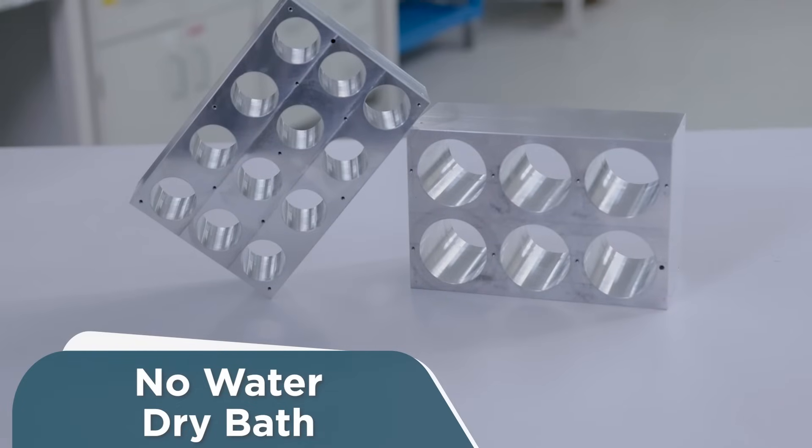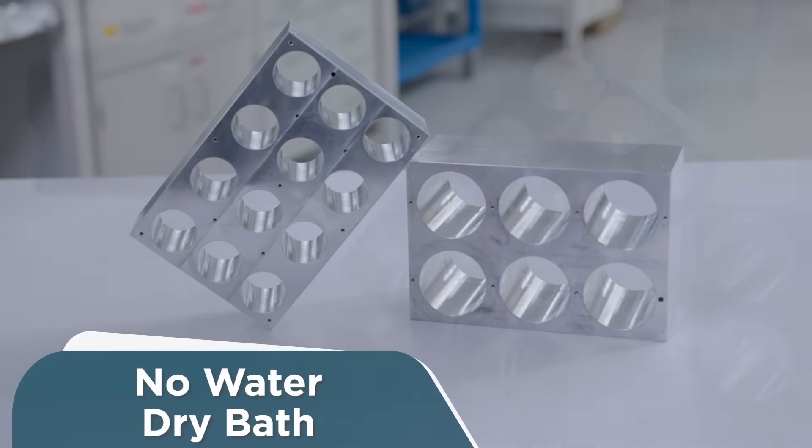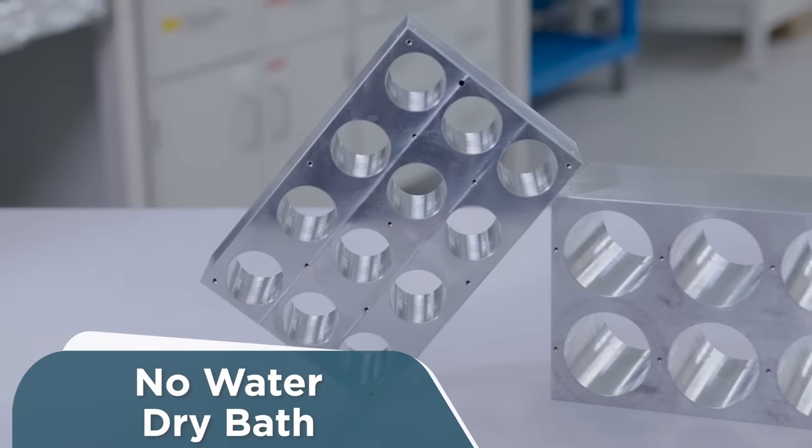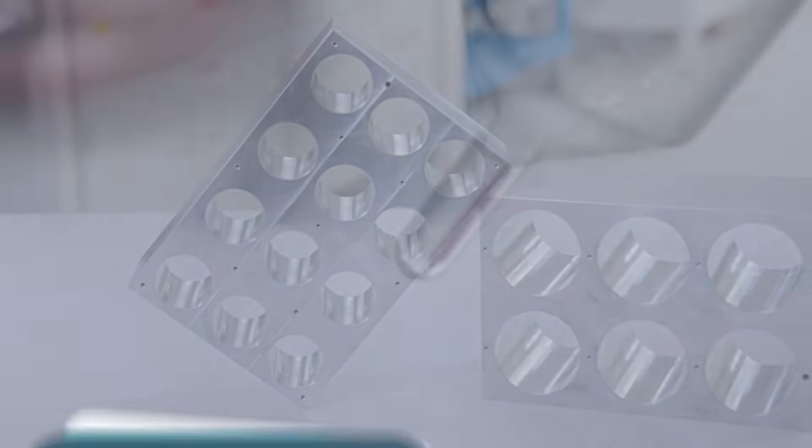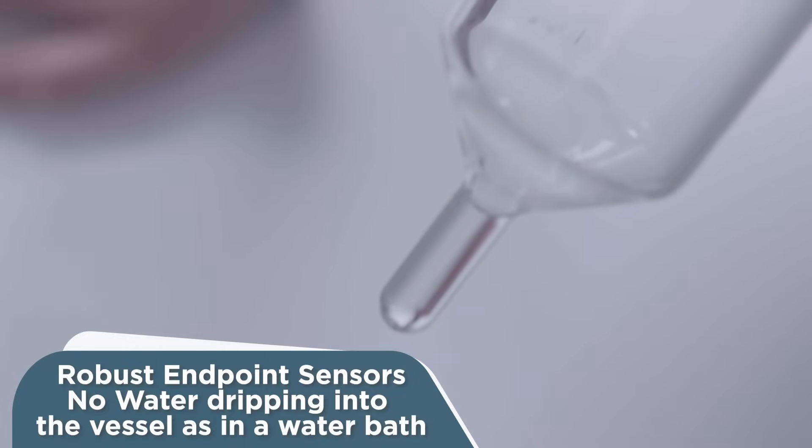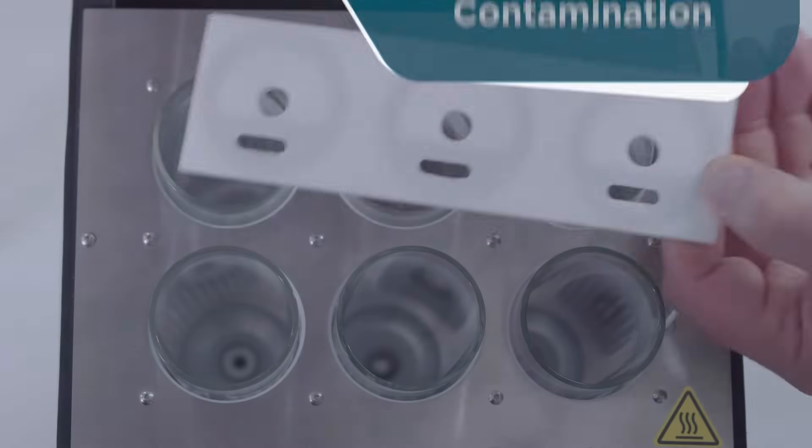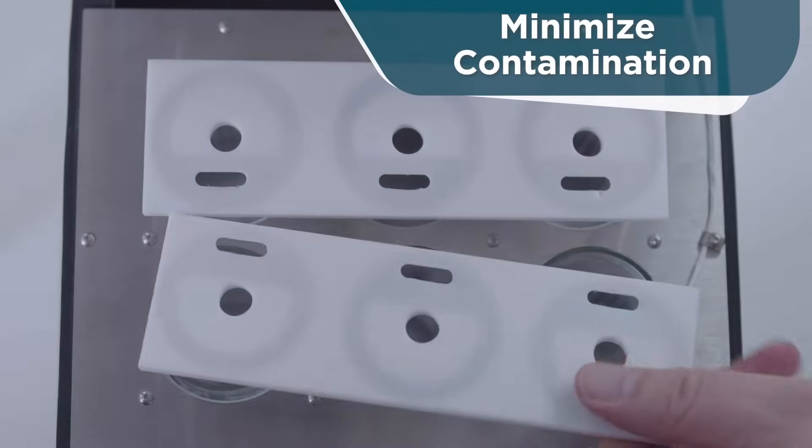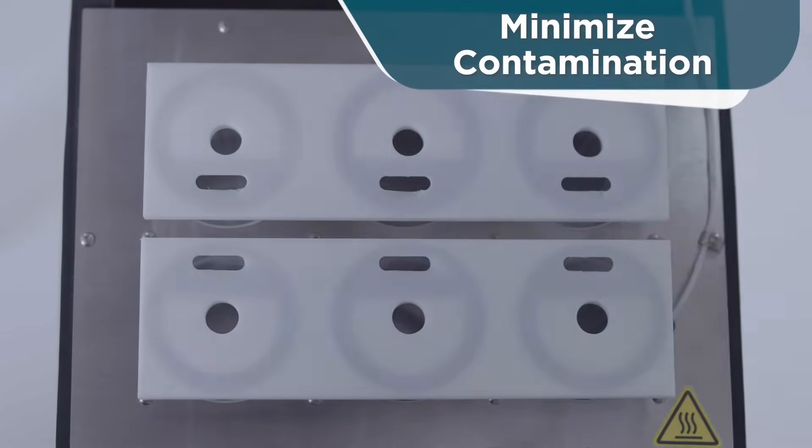The SupraVap uses a robust, waterless, dry bath. With no electronics submerged in water, easily and inexpensively capture solvents. Vessel covers eliminate the possibility of outside or cross-contamination.